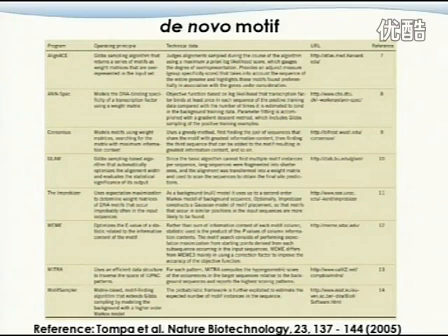It will just take much longer to run, and you have to take precaution on that. So I heard there's some effort to work on de novo algorithms based on ChIP-seq level data. I haven't seen too many publications, but if you find some, do let me know, and I'm happy to read those.